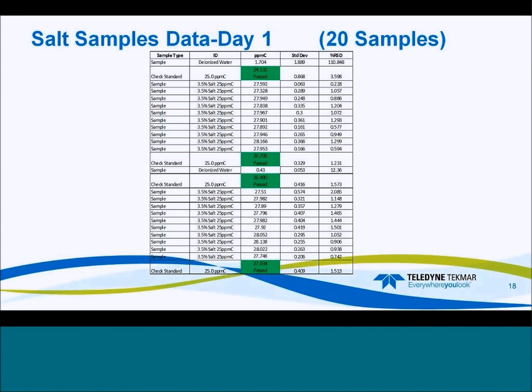With the unit, about 200 milliliters go into it, so that means about 200 milliliters come out of the vent. So when you're doing a leak check, you can take your standard flow meter and put it out the vent to the back and verify that there's 200 milliliters going out of the unit and into the unit. And this will come in handy throughout if you're running lots of salt, so you can tell if you've got a blockage or if you have a leak or anything that's not quite acting correctly.